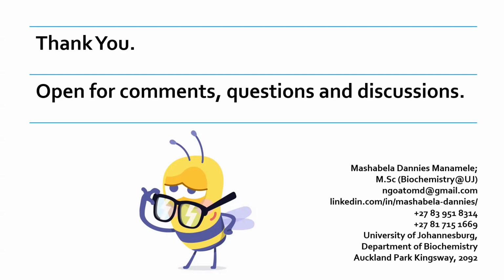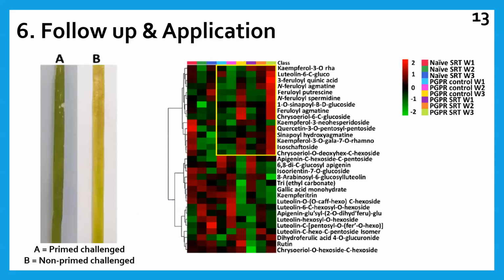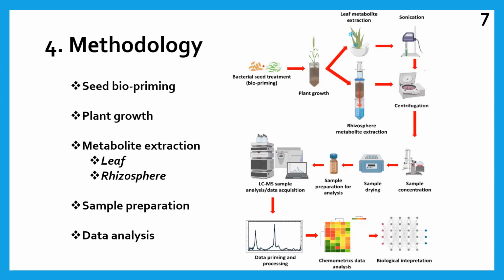Okay, let me get to that slide. For the extraction of the rhizosphere, we would collect the falcon tubes that we grew the plants in. They were perforated, so we poked holes at the bottom of the falcon tubes and put sand in there. We grew the plants in sand, and this was important because it would make extractions much easier. After harvesting the leaves, we left the root material in the sand first.